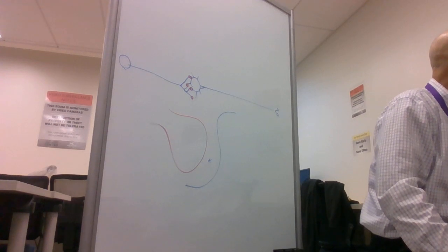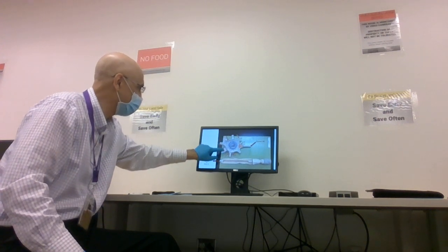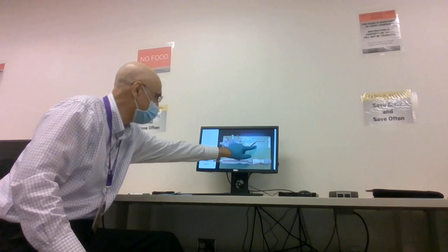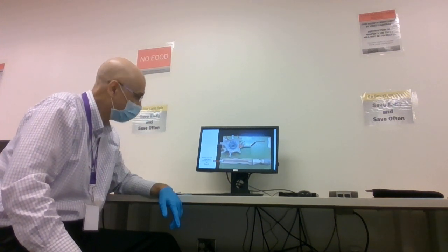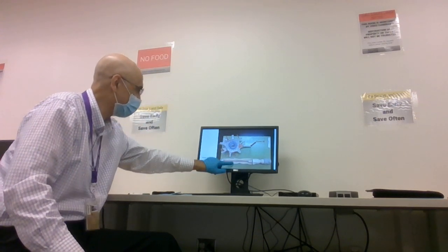Okay, quickly, let me repeat. Cell body, agree? The white stuff is the short one, the dendrites. Anything attached to the dendrites are the axon terminals of the other neuron. And then there's the axon. The first part of the axon, this red part, is the axon hillock. This is still the axon, the part in the middle. And the cell outside is the Schwann cell.